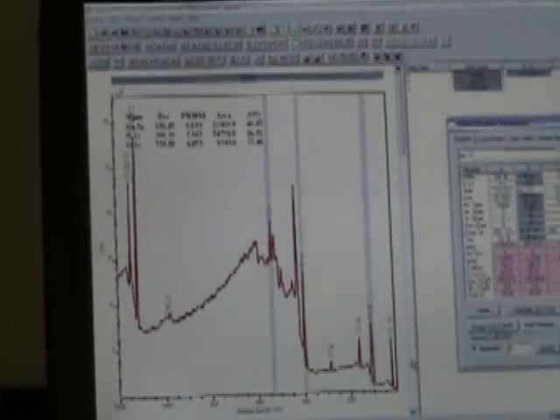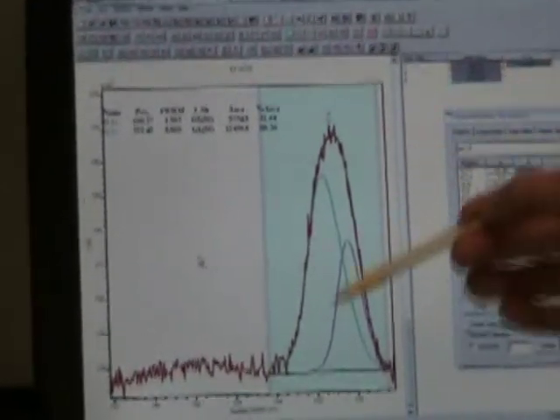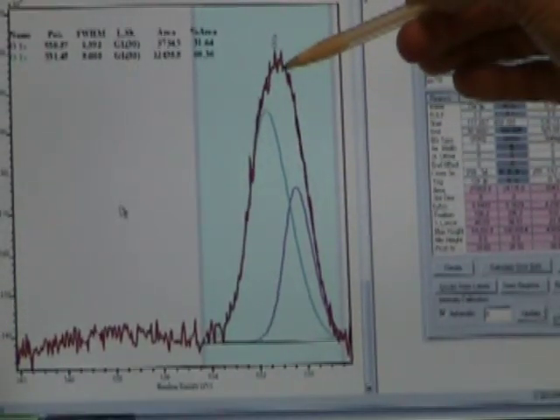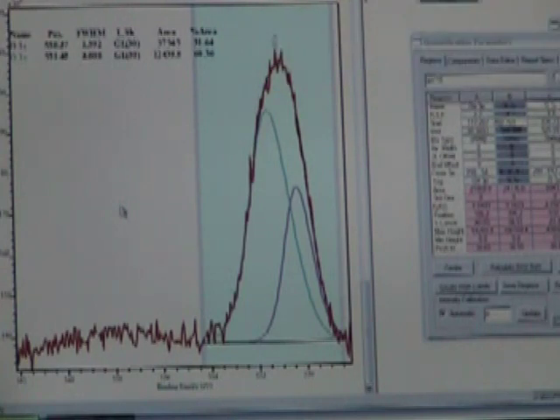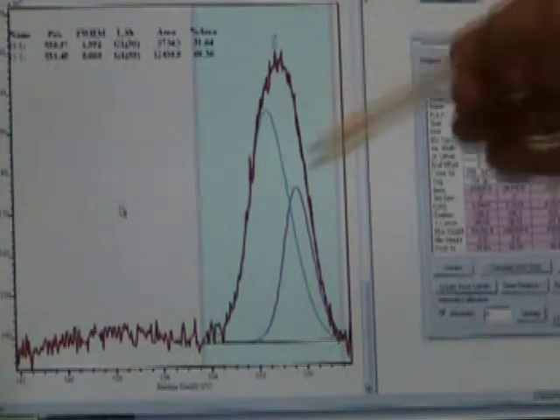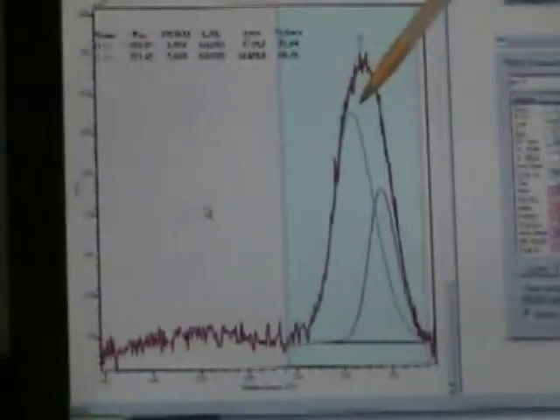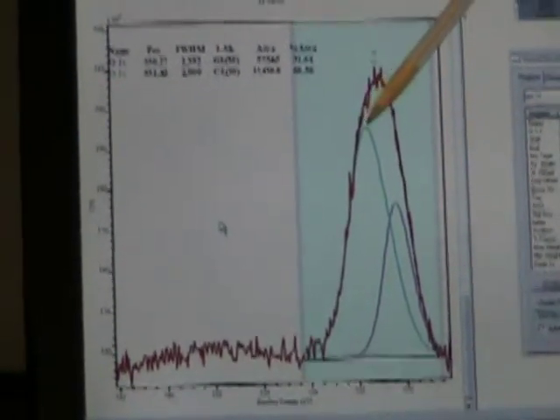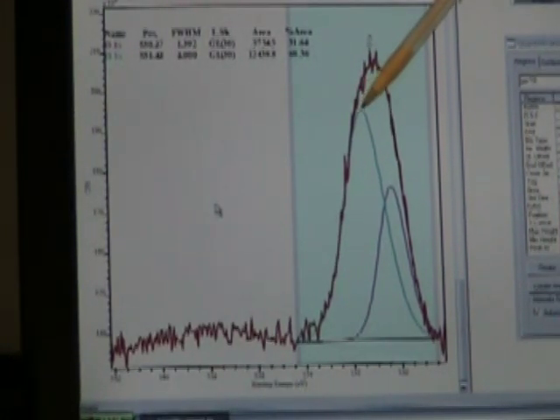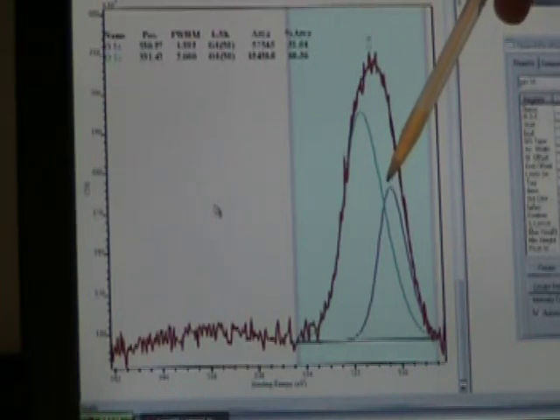But we expect in the real world that there will be some involvement with oxygen. So what we can do now is take a look at the high-resolution peak that we did on the oxygen peak, the high-resolution scan. And if we go there, what we find is an oddly shaped peak. This is the experimental peak, this red one, that doesn't really fit any sort of Gaussian-Lorentzian mix that you would expect for a single peak, and it can only reasonably be fit as two or more peaks. And when we fit it this way, we find that we have two peaks, one that's out towards 532 eV and is looking more like adsorbed oxygen, although there may be a little bit of hydroxide involvement there.